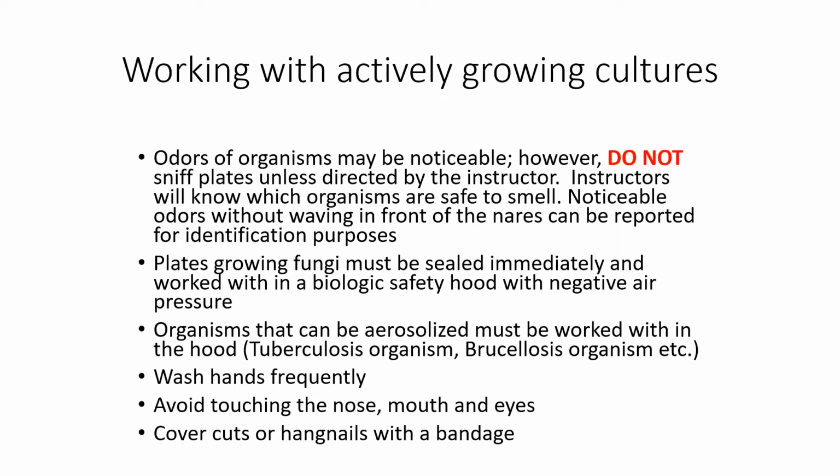Now, anytime you're working with plates that are growing fungi, you have to seal those plates immediately and also work with them in a biological safety hood with negative air pressure. You don't want any spores getting into the laboratory and ending up on your other culture plates. Now, there are some organisms that can be aerosolized, so you have to work with those inside the hood, and that would be Mycobacterium tuberculosis or Brucella. Okay, we want to wash hands frequently, avoid touching our nose, mouth, and eyes, and then cover all of our hangnails or dry skin or any cuts that we have on our hands with a bandage.